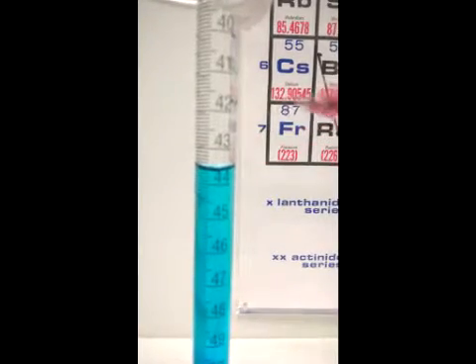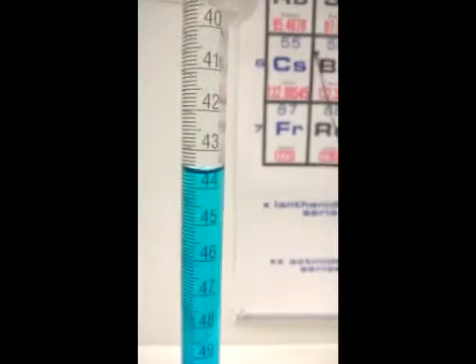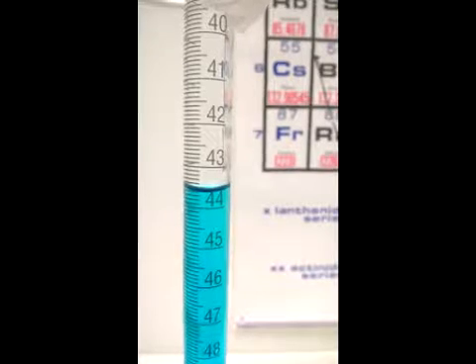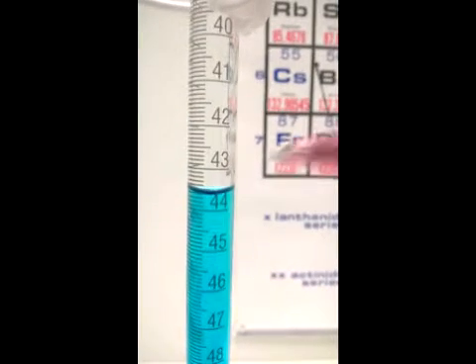Here we have 1 milliliter increments from 43 to 44 milliliters. The next thing to do is to measure the value of the solution level.